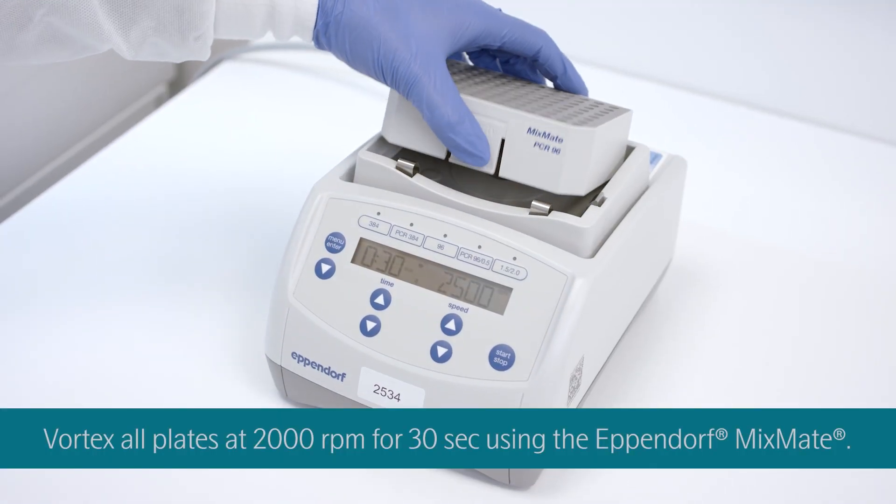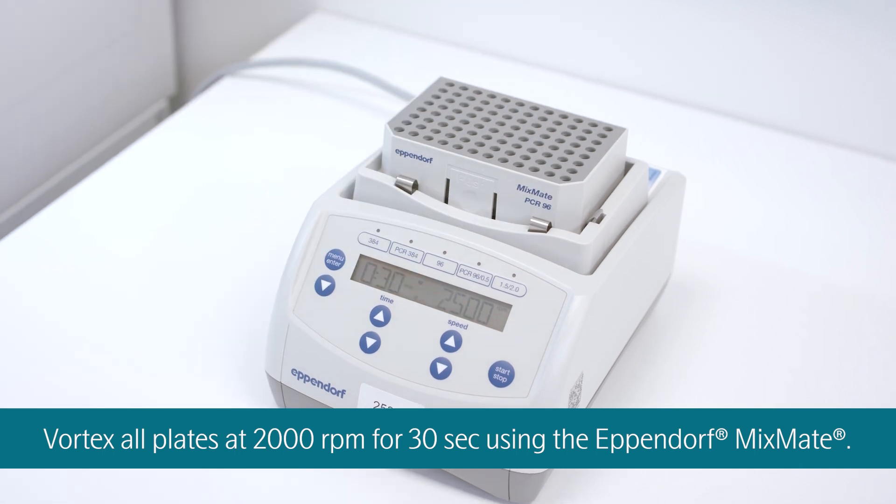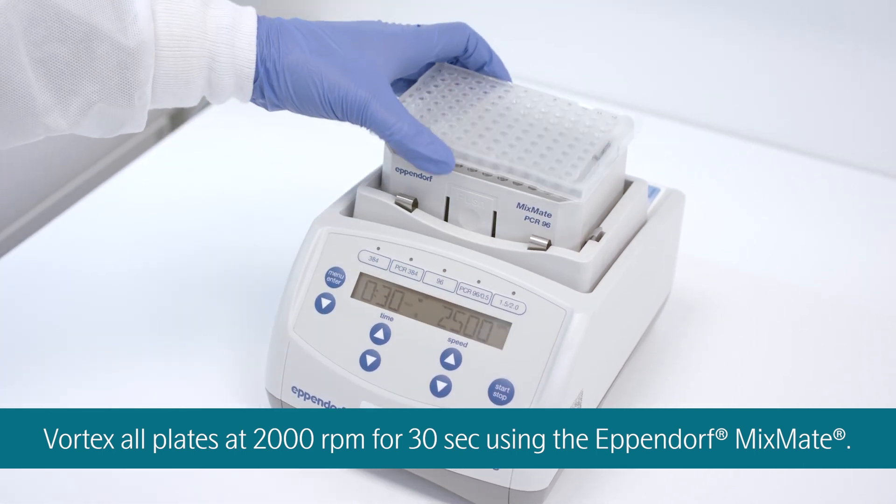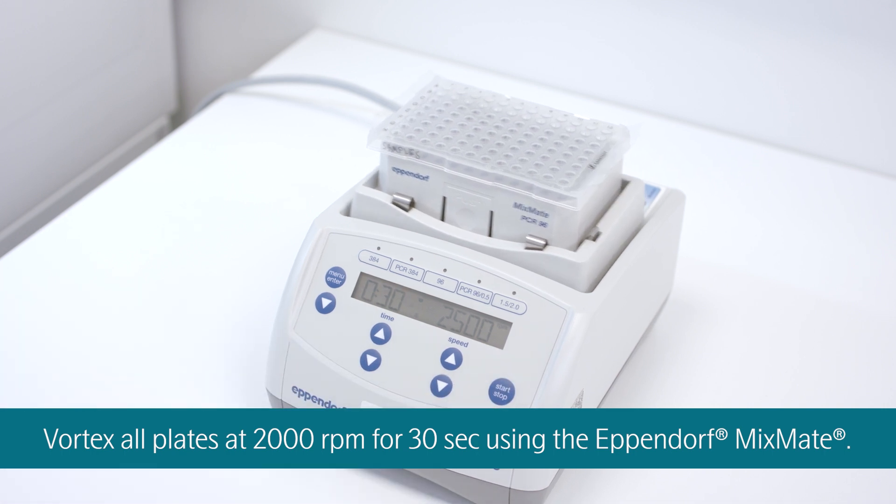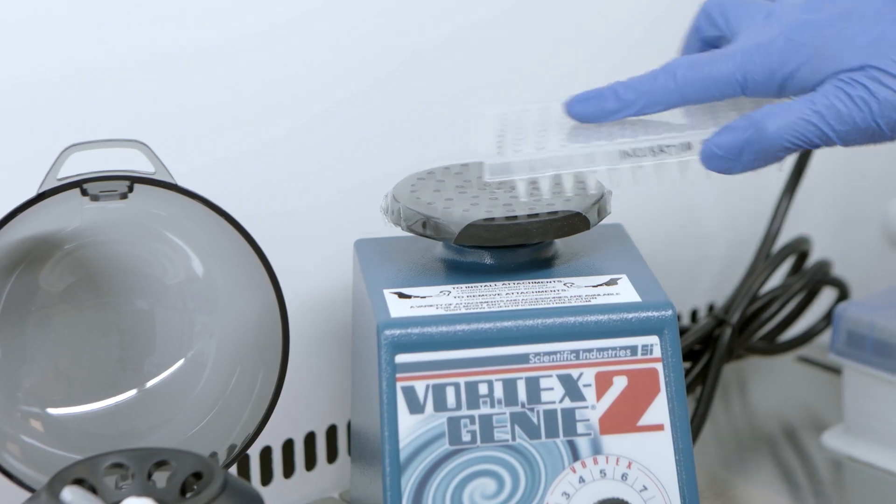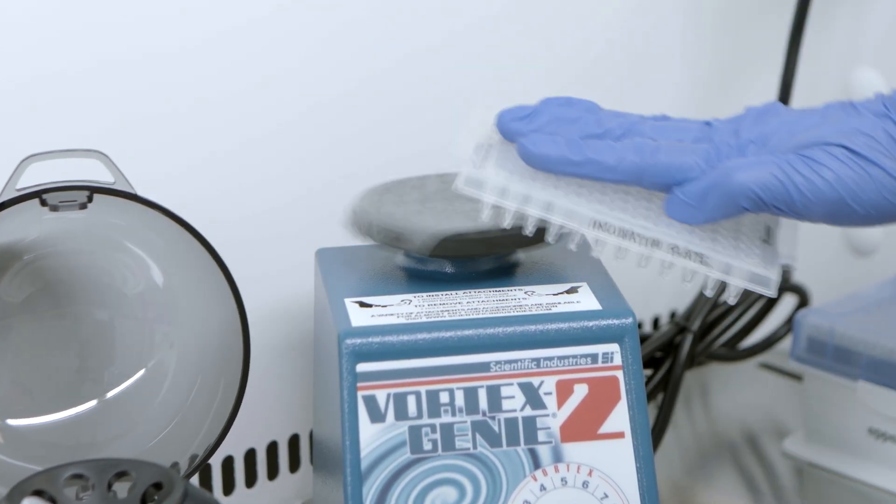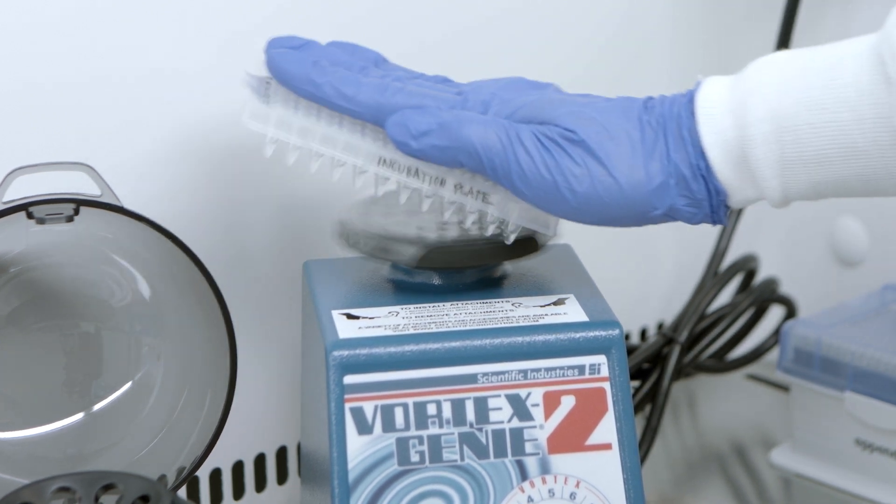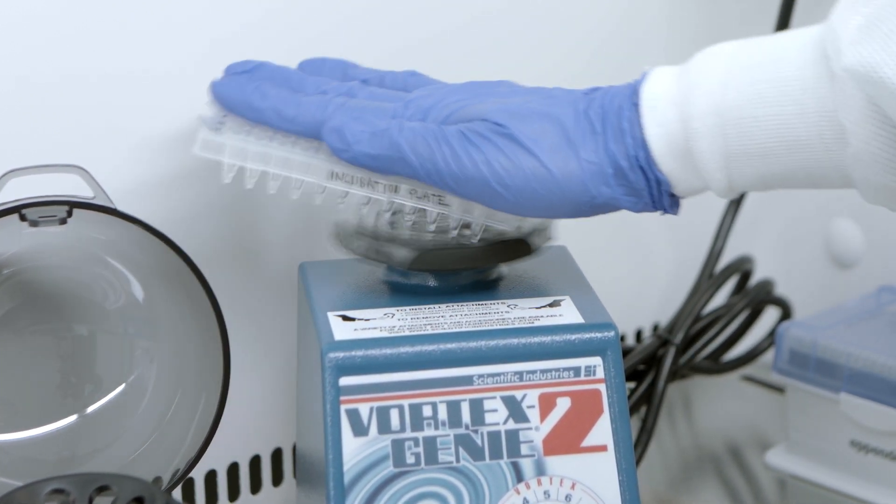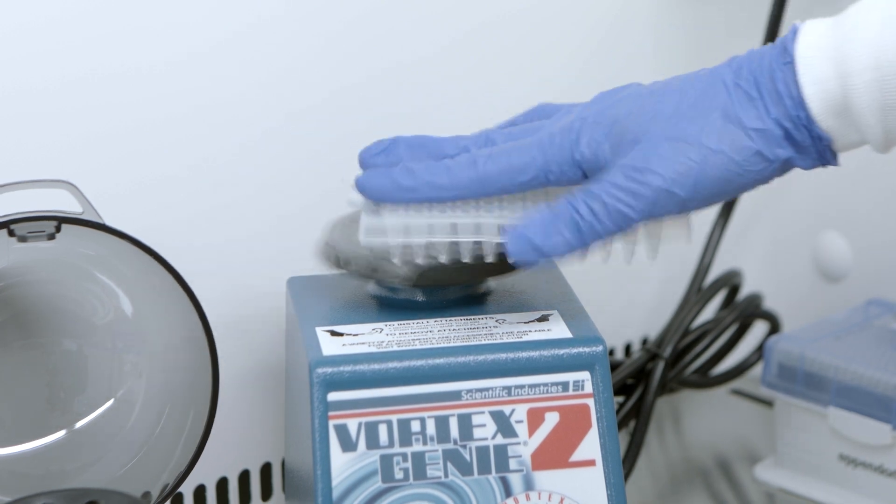Plate vortexing should be performed using the Eppendorf MixMate and the appropriate tube holder. This is required for the pre-PCR plate vortexing, but optional post-PCR. If manual plate vortexing is used post-PCR, it must be done using the technique shown here. Please watch the O-Link vortexing technique video before continuing.